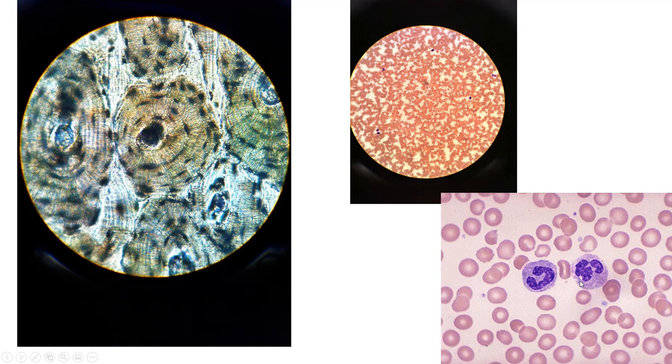Come over here. This is the blood. So this is just whole blood. All of these reddish orangish cells in the background, these are red blood cells or erythrocytes. The purple dots would be the white blood cells. We zoom in, you get a better picture. All of these are erythrocytes. These are white blood cells known as leukocytes. And then these tiny little specks like this and like this, these are the platelets or thrombocytes.